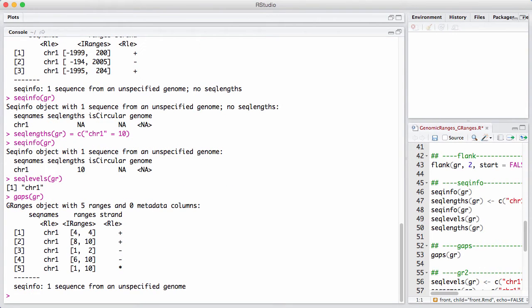So here we get one surprising thing. The first thing is you can see that the star strand is treated differently from the positive and the minus strand. There were no ranges originally on the star strand. So therefore, when we take the gaps, we get the entire star strand back.